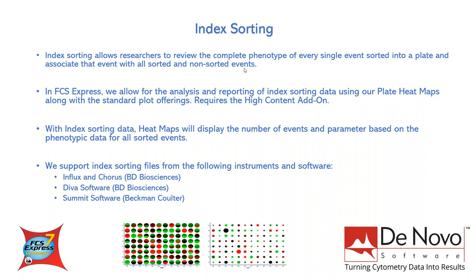In order to work with index sorting data in FCS Express, you will need to purchase the high content add-on. With index sorting data, heat maps will display the number of events and parameters of the phenotypic data for all sorted events. Wells may be gated on individually or as groups using well gates, which are then back gated onto other plots to view the individually sorted cells in the context of the entire acquired or sorted samples.